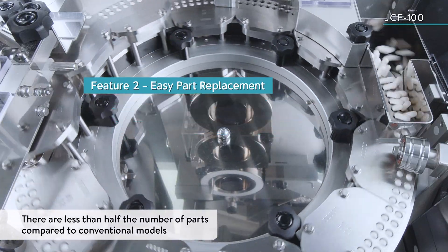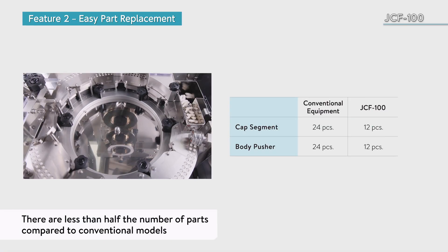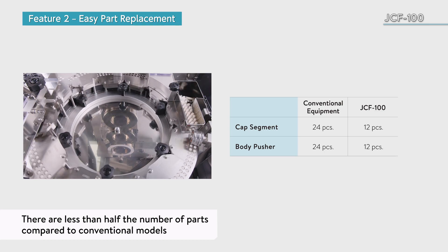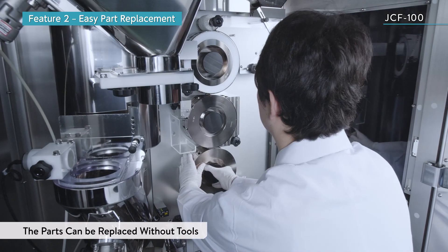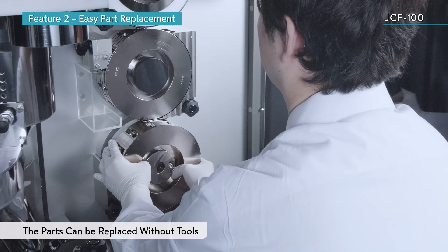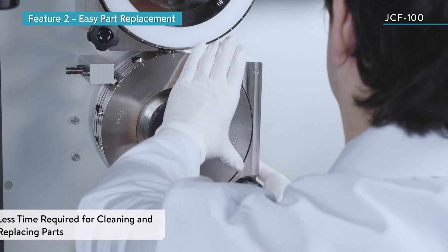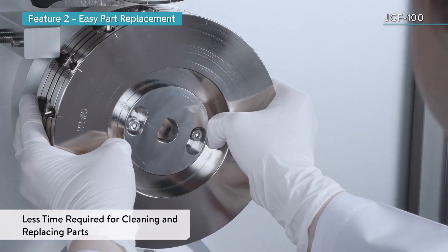The JCF-100 has less than half the number of parts compared to conventional models. In addition, the parts can be replaced without tools. This reduces the amount of time required for cleaning and replacing parts.